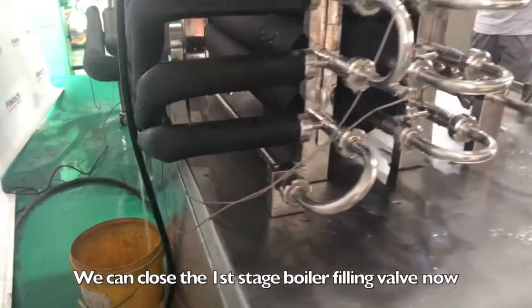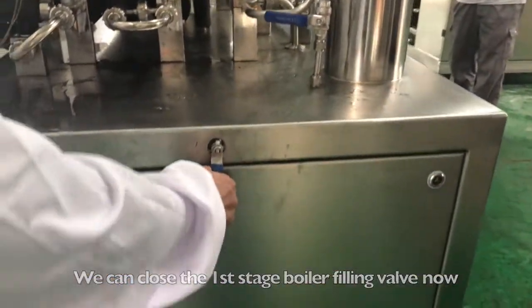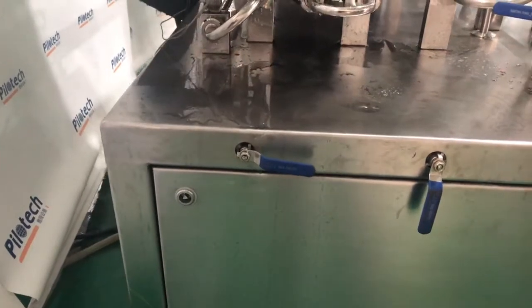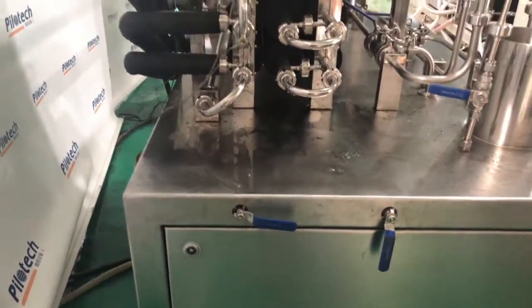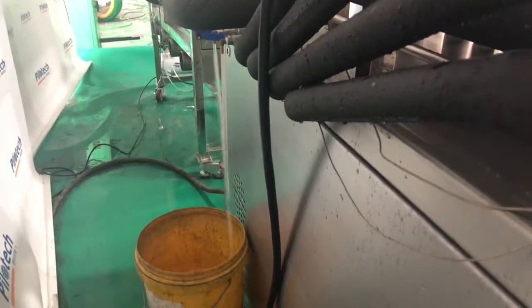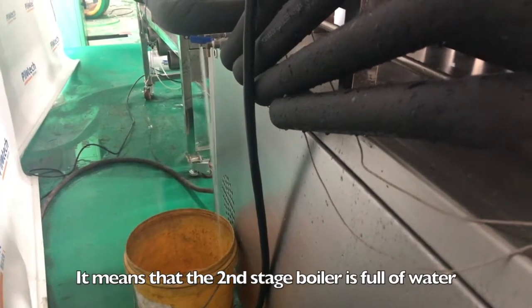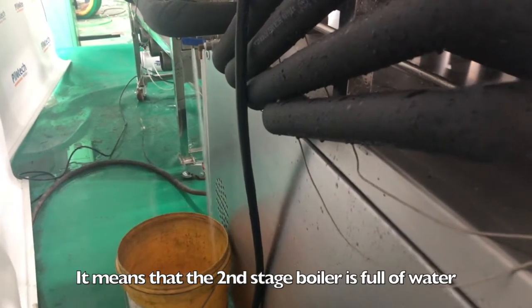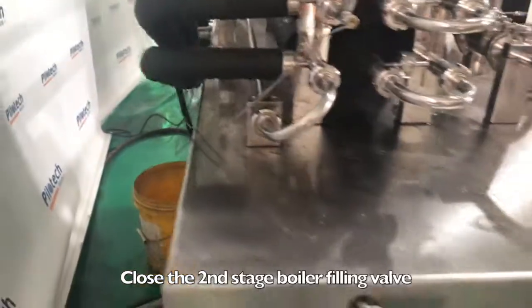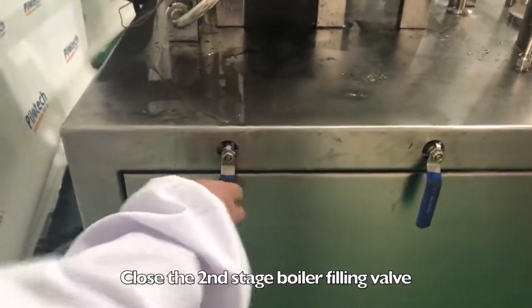Close the first stage boiler filling valve. Open the second stage boiler filling valve. When water comes out from the second stage boiler overflow, it means that the second stage boiler is full of water. Close the second stage boiler filling valve.